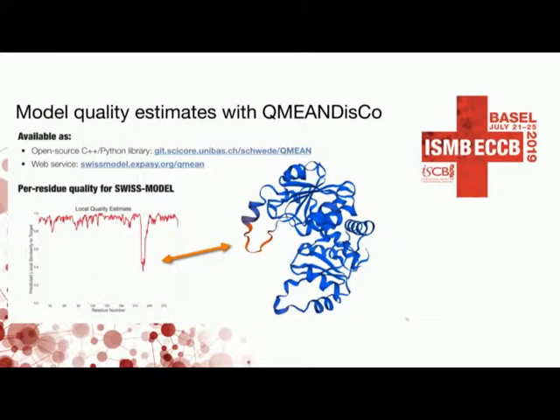So what you see there in colors and also in the plots is how accurate we believe that at each residue, how well we capture the neighborhood of this residue. So it's basically trained like this: if I knew the correct solution of this protein, and I was looking at the residue and all its neighborhood, how many of the interatomic distances do I capture correctly? And if we think that I capture all of them correctly, it will be blue. If I think that we don't capture them very well, you'll get orange and the lower value.